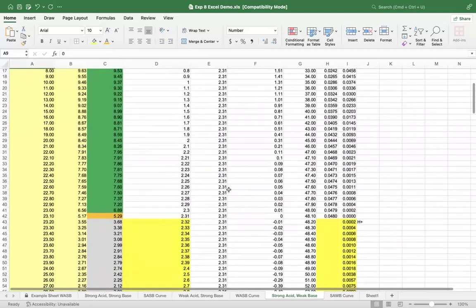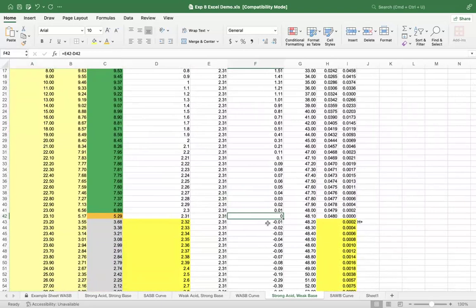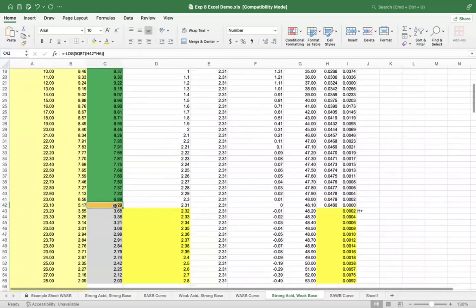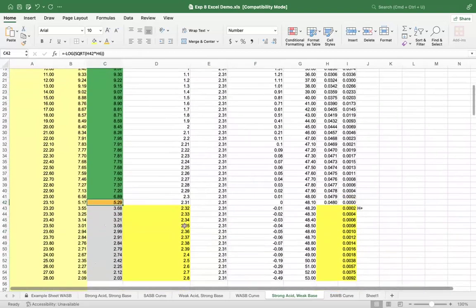The second one happens at the point right before my numbers switch negative. And that's where I know the end of my buffer period is. So everywhere in between those 2 points is the Henderson-Hasselbalch zone. And then anything after that point, where the number goes negative, you're in the top half of the curve.